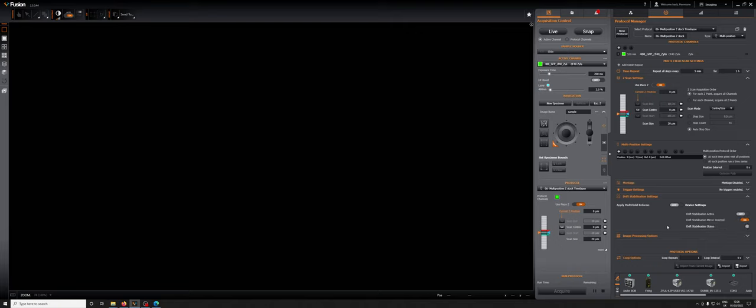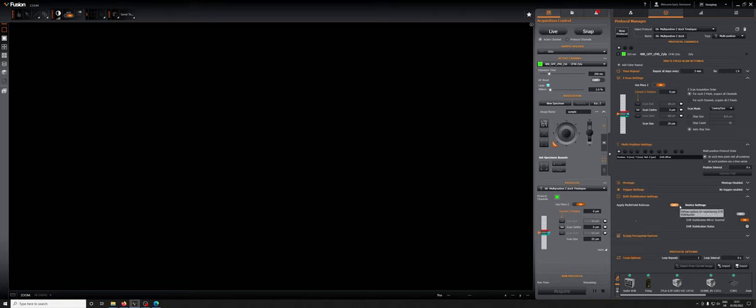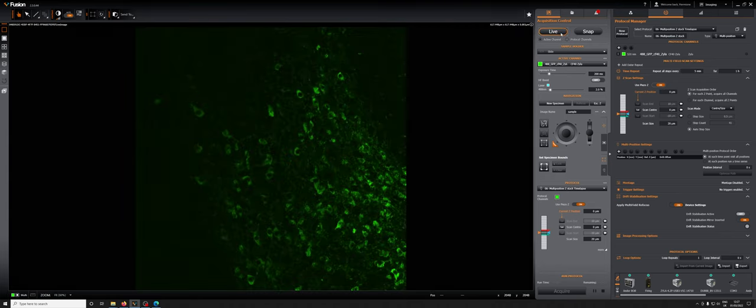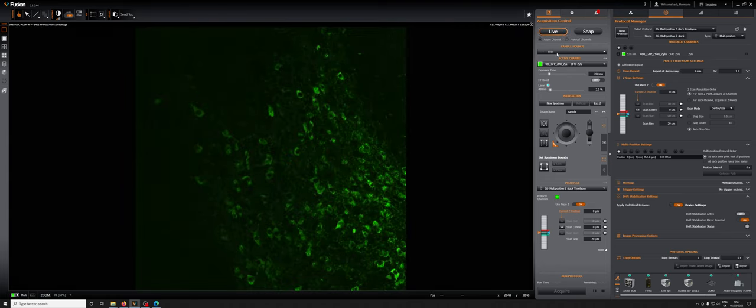Let's look at the steps for adding multiple positions with drift stabilization. First, we want to make sure as always that our piezo is at zero, and we're going to turn on the apply multi-field refocus. We're going to go to the first position, which I've already done. I've looked by eye and we're in a position where there's something, and we're going to go to live and focus on this position.